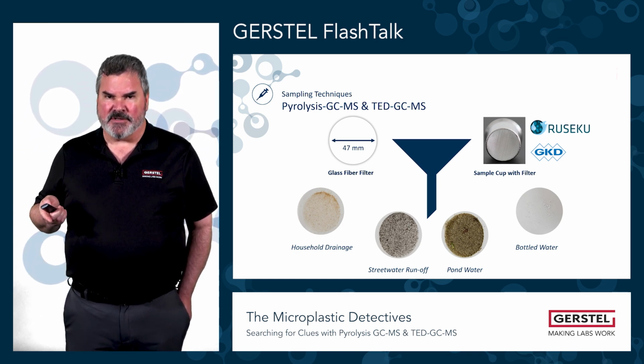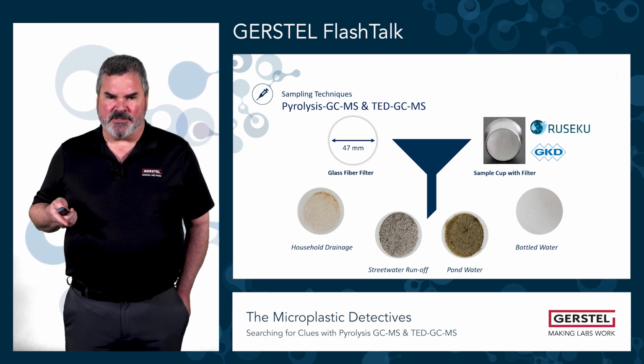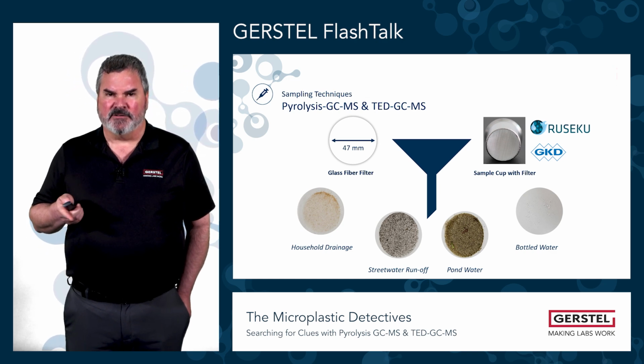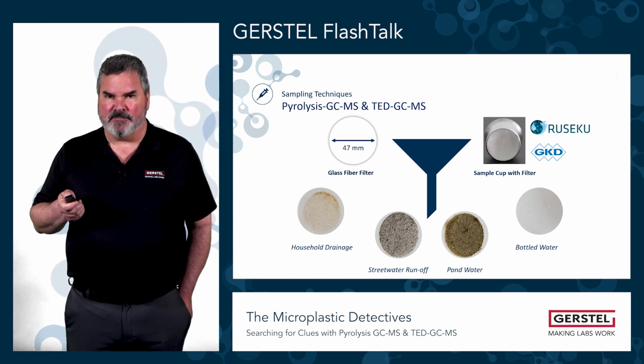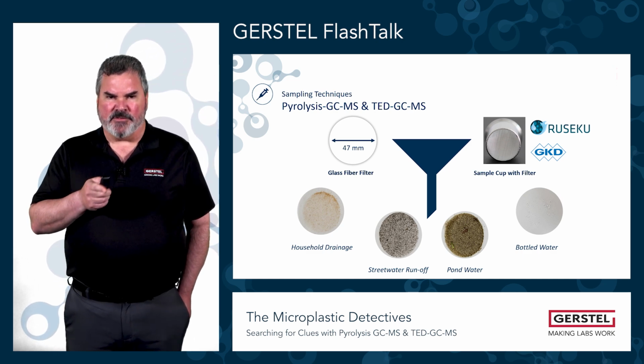The bottled water example, of course, is very clean, but there are microplastics present there. Obviously, the pond water drain-off is going to be the worst out of all of it, containing a lot of organic matrix in there that we need rid of. But if we're going to pyrolyze, we'll take water through that filter.